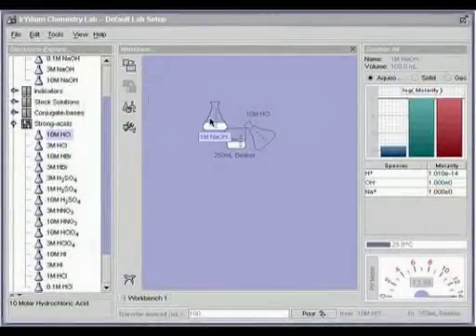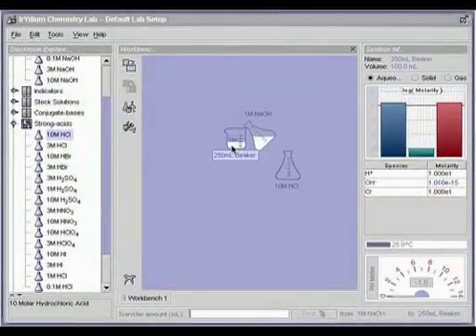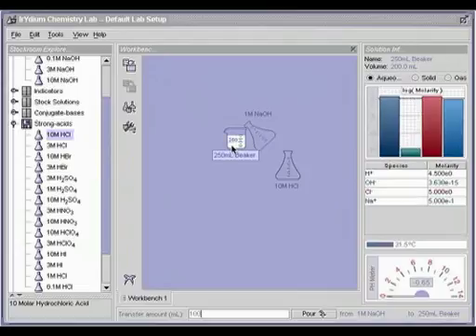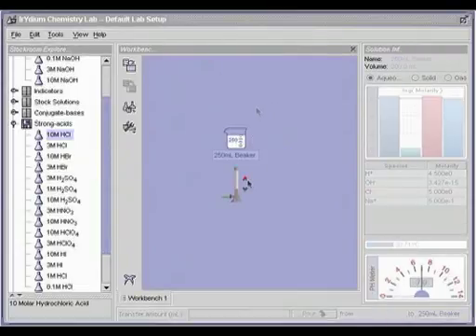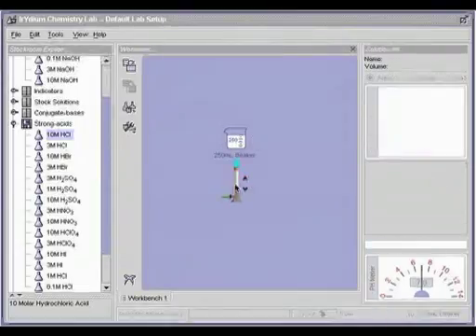The solutions info panel shows the current state of the selected solution. This changes as solutions are mixed, heated and cooled.